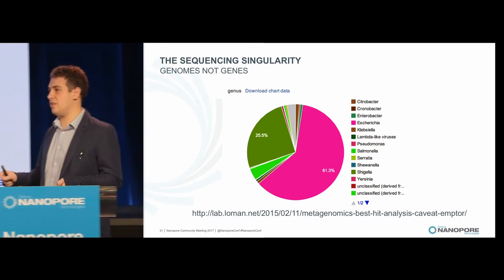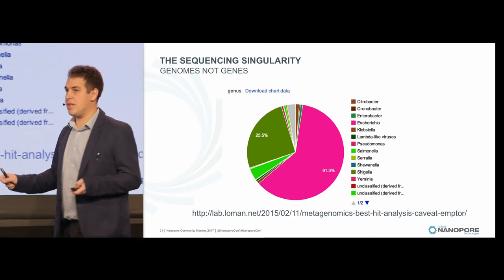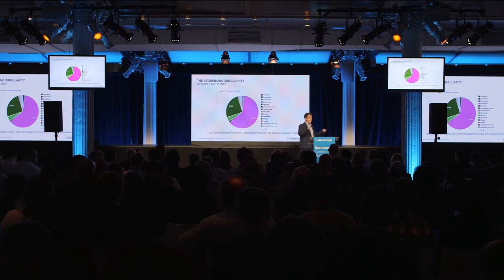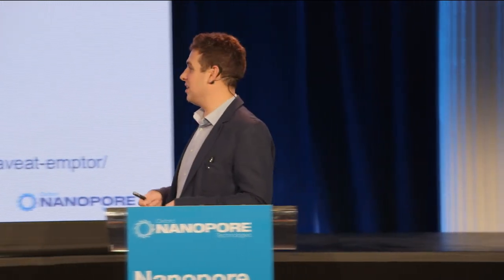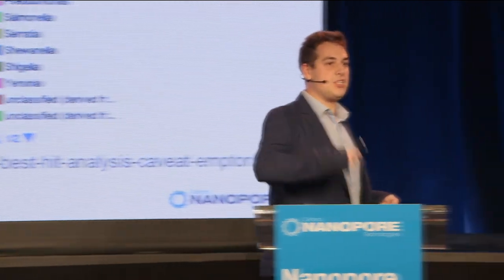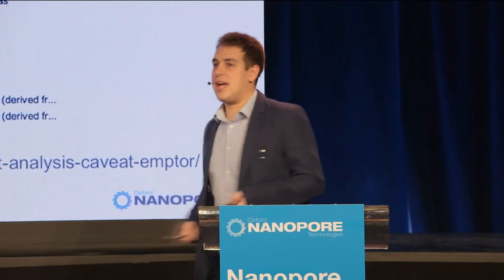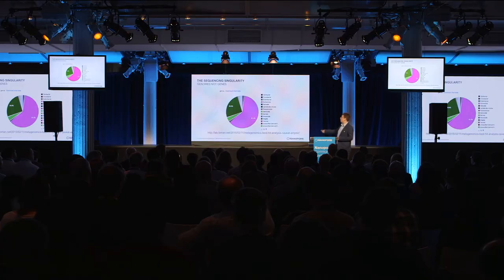Just detecting a pathogen will not be sufficient, particularly because if you've ever done any of this sort of metagenomic sequencing, the bag of crap at the bottom of your sequencing library has all sorts of things in there, all the things you've ever sequenced in your entire career, like an inventory of contamination. And we have this issue: you take a short read library and do a very naive taxonomic approach. You take something like K12, shear it up, and then just BLAST those short reads. This is the sort of profile you get.